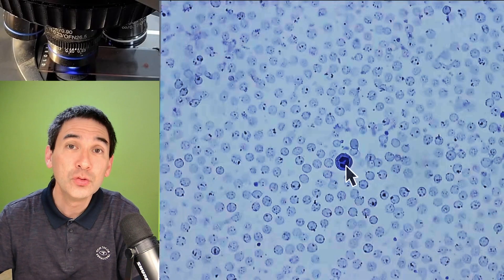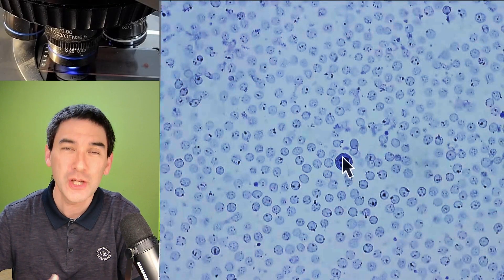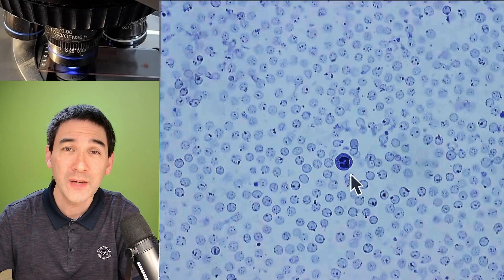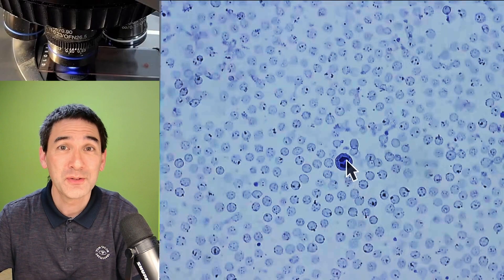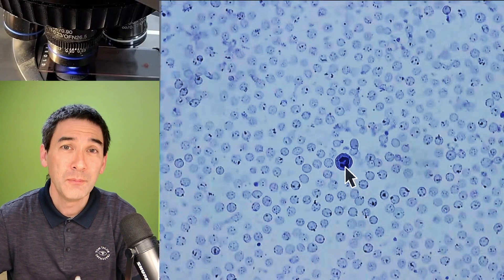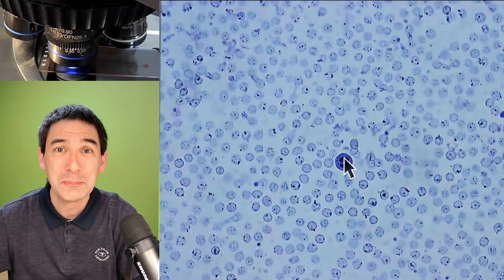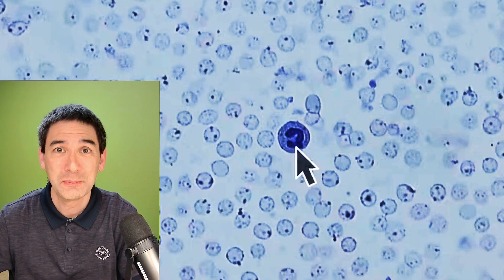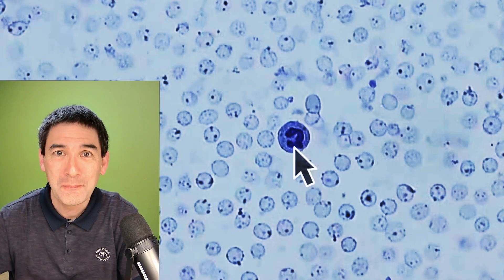Some white blood cells have an irregularly shaped nucleus and depending on the shape you can actually categorize and classify the different types of white blood cells here. Obviously there are many more red blood cells visible than white blood cells here. Slightly larger magnification again.